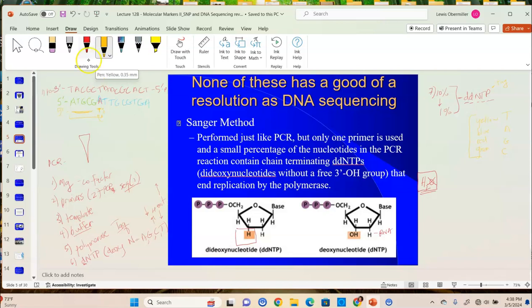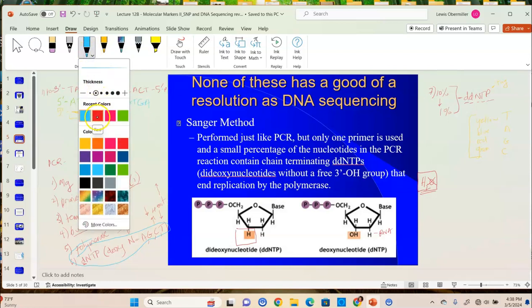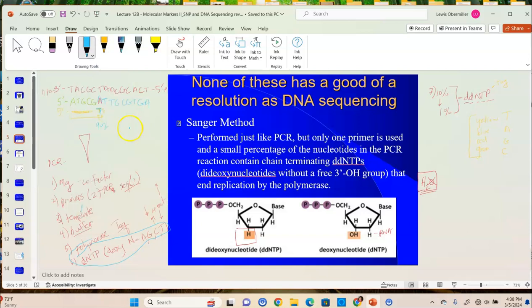The rest of the time we're going to get a normal T, right? We decided to use blue here. So the rest of the time we get a normal T in here, from this pool here. These dNTPs are completely normal. They're not fluorescently labeled. So 90% of the time, we're going to get a normal one that has the hydroxyl group, and it's going to go to the next letter, which is, in this case, A. Blue is a bad color choice, but let's just say that's a perfectly normal A that's going to get incorporated.